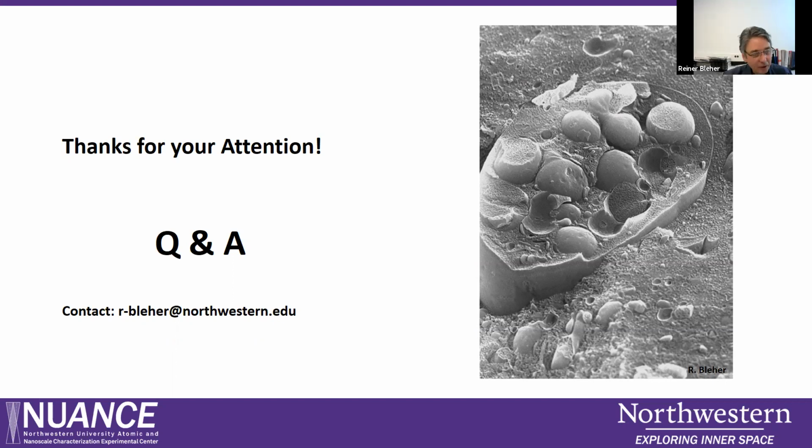Yeah, that is very important indeed. That is why we always have to talk with users to find out what they exactly want in order to decide which method is best. Because it does not always make sense to start with the most complicated technique. So you start with the simplest, see if it works, and then go up in complication if you need to.